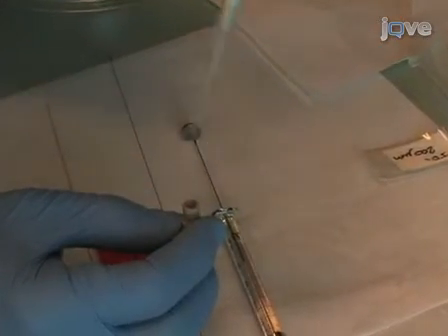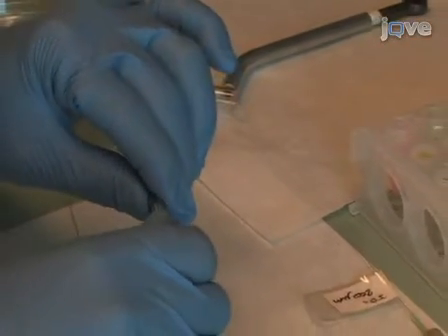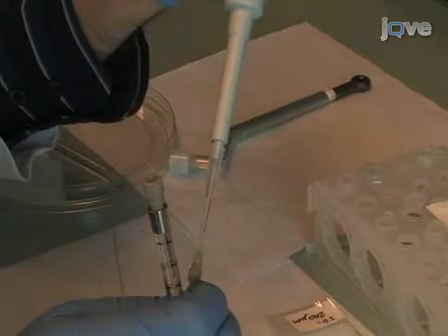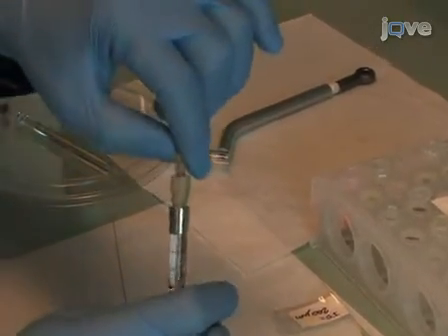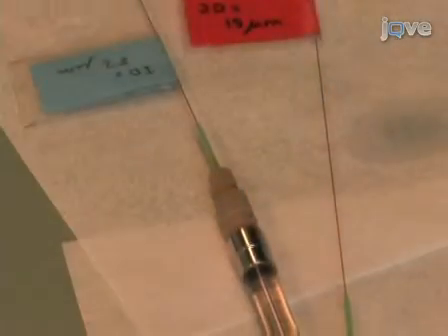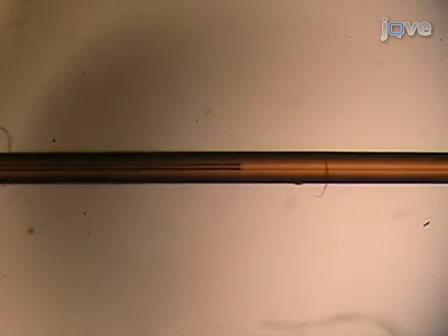Next, using nano-tight fittings with low dead volume, the syringes are connected to capillary tubing. The capillaries are then filled and checked for bubbles under the microscope.